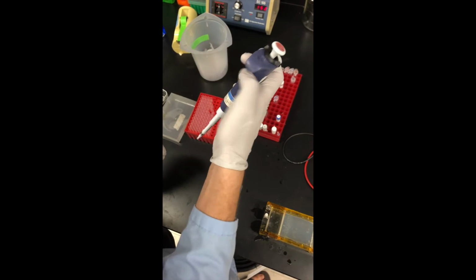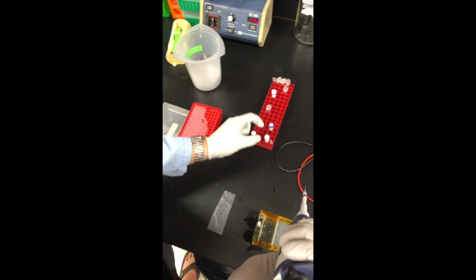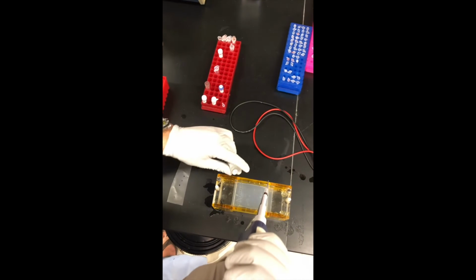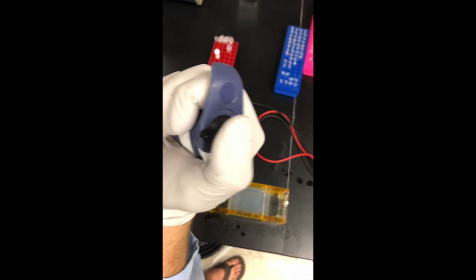So now I'm going to take your P20 and you're going to load the ladders. So you have your 1 kb ladder and your 100 BP ladder. And I usually like to space it out to where the 1 kb ladder is at the top and the 100 BP ladder is at the bottom, but it's really just up to preference. So we're going to take 5 microliters of both.